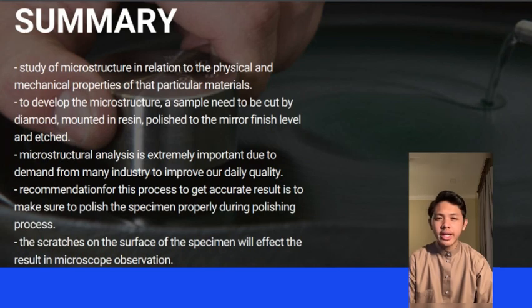For the recommendation, the specimen needs to be polished perfectly to get an accurate result. Scratches on the surface of the specimen will affect the result in the observation.